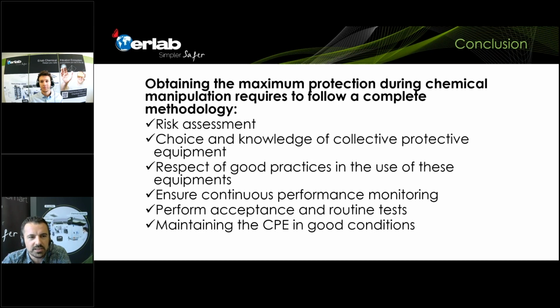So we have another question from Vina Rose Ambas. Do you need ducted fume hoods for each hazardous chemical you handle, or just one unit of hood for the whole laboratory? What if a lot of chemicals are being handled at the same time?